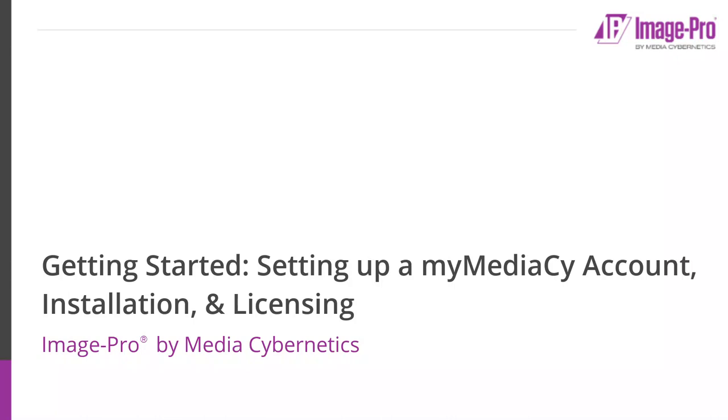In this video, I'm going to describe how to license ImagePro. We've implemented an easy to use flexible system called license linking. License linking is done using a simple tool called the License Manager.